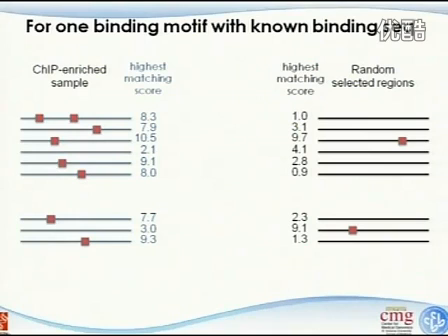Calculation-wise it's pretty heavy, but it's not that bad. You can do that pretty quickly. For the randomly selected regions, you will still sometimes happen to see a sequence with a real binding site, so a pretty big score, but it will occur at a much smaller frequency. Okay?